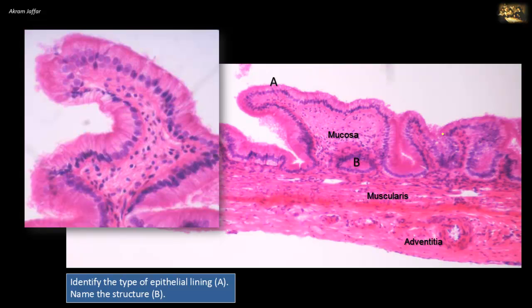The muscle fibers do not segregate into two distinct layers as elsewhere in the gut tube. This arrangement conforms to the necessity of mass contraction to reduce the size of the organ rather than peristalsis. In fact, this is the wall of the gallbladder. The gallbladder is a muscular sac that concentrates and stores bile. When it contracts, it expels the bile into the duodenum. The epithelium is formed of simple, very tall columnar cells with basally located nuclei, as seen in A.